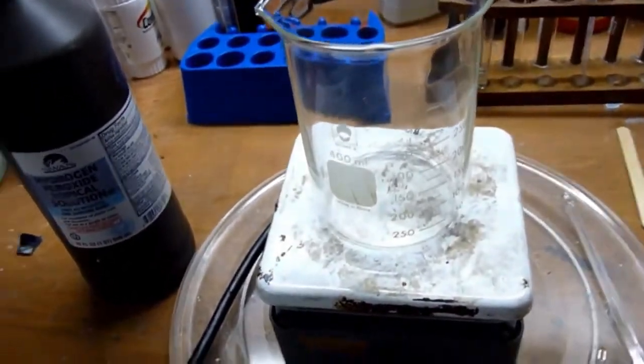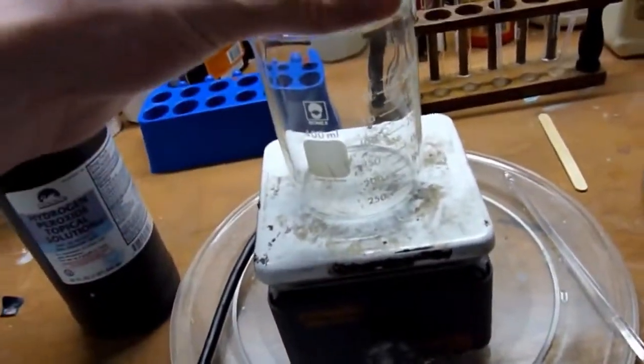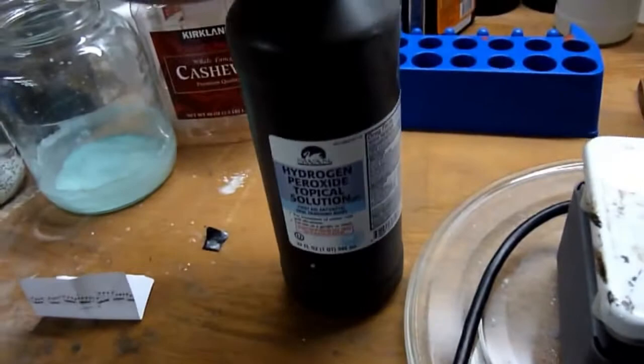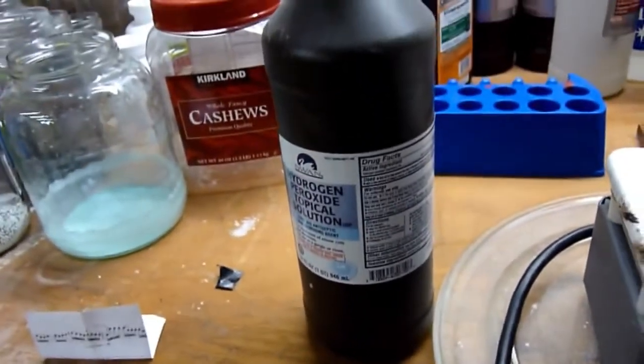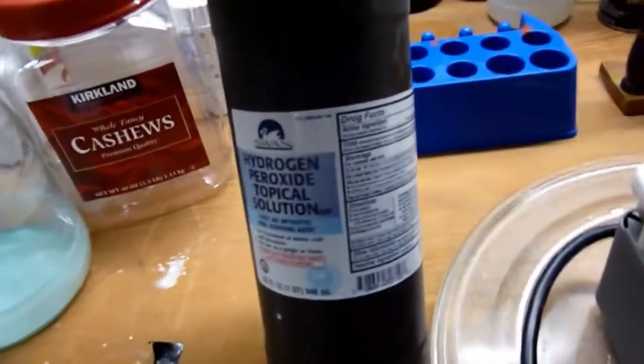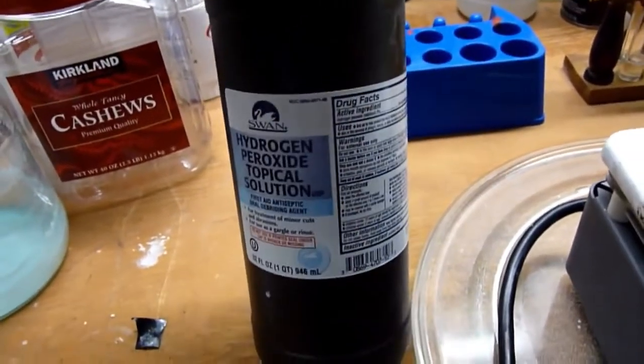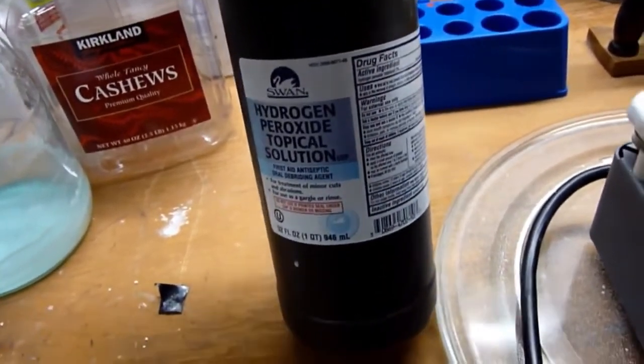We're just going to basically force evaporation by heating it up a little bit. Heating the hydrogen peroxide causes it to decompose. So we can expect some decomposition to happen of hydrogen peroxide into water and oxygen gas. But as long as we keep the heat low enough, the decomposition will not be too much of a problem.